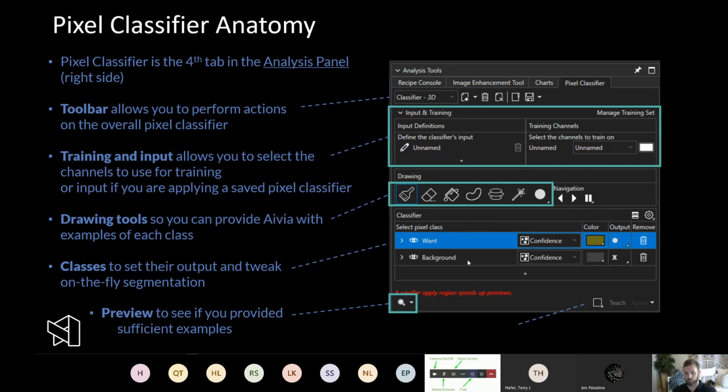If a tree has to branch into more and more decisions, then to a certain limit, there's going to be a limit to this, but theoretically that makes the algorithm more accurate, but it takes longer to compute. So we give you some control over your preview about the depth of that tree, the decision tree, so that whenever you're interacting with and drawing the classes that you want, you can choose whether it's faster to update or more accurate whenever it does update.